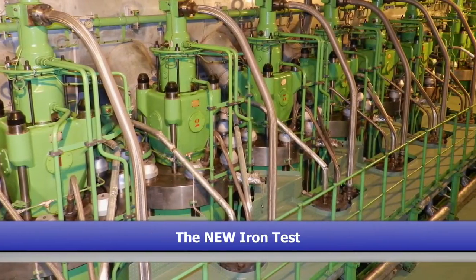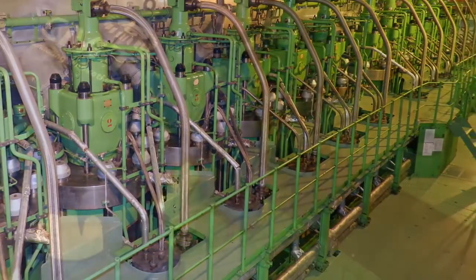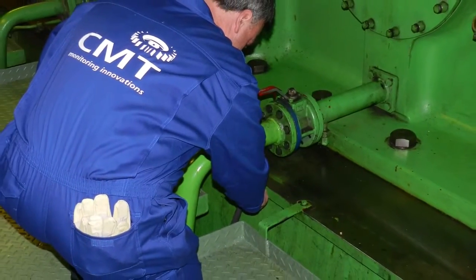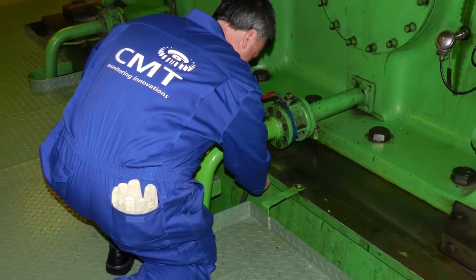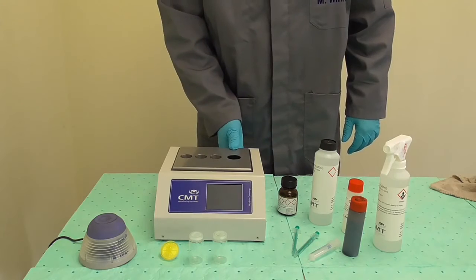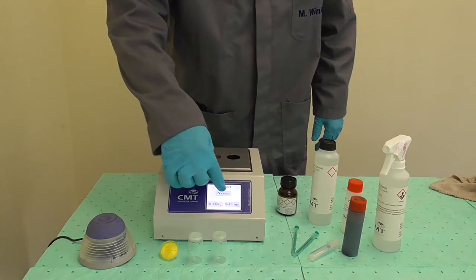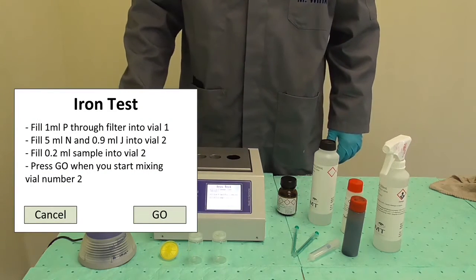This video describes how to use the new CMT iron test kit. Take a fresh oil sample from the piston underside drain valve. Switch the device on. When the main screen is displayed, choose measure and follow the instructions on the screen.